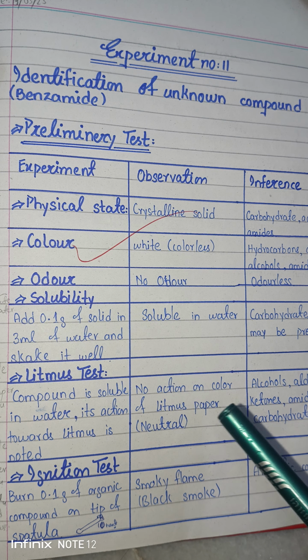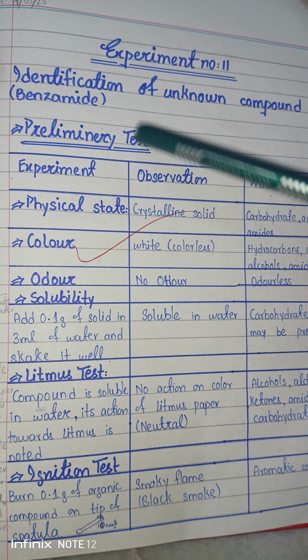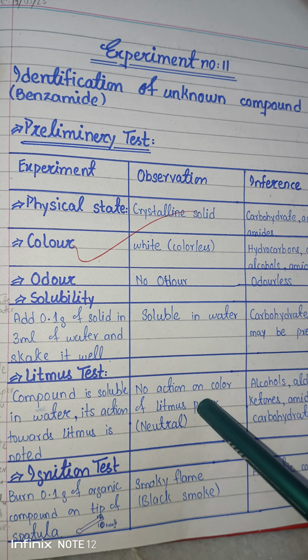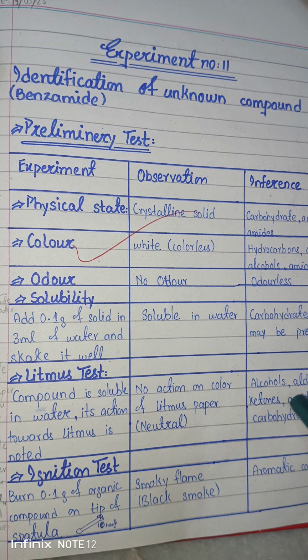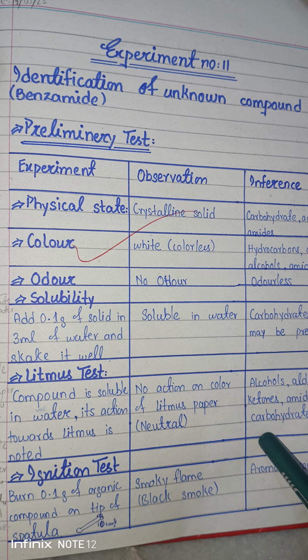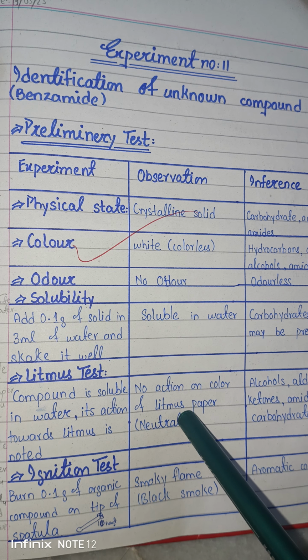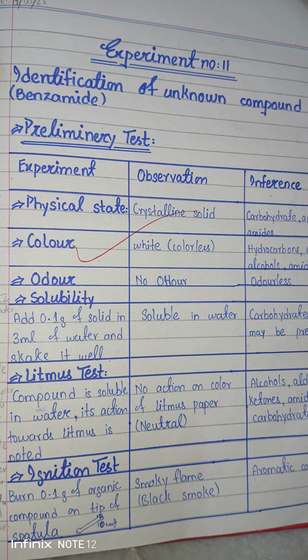Water also has pH 7, so the benzamide solution has pH 7, so the litmus paper is showing no color change. Now some alcohols, aldehydes, amides, ketones and carbohydrates also show a neutral litmus paper, so therefore we are saying that they could be present.